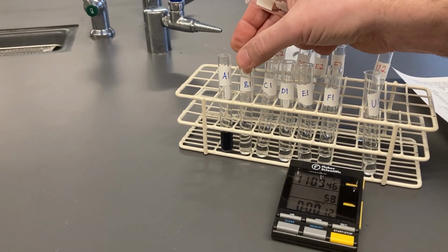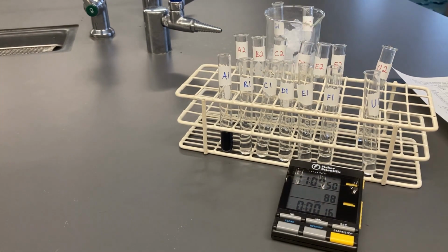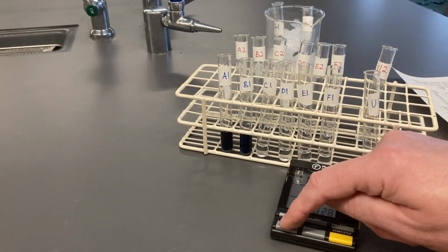There's our B1, so you can see the reaction taking place. And again, when it changes color, you want to note the time of the reaction. There we go. Now I'm going to do the same thing with C1 and C2.